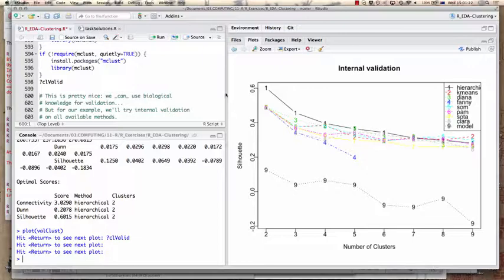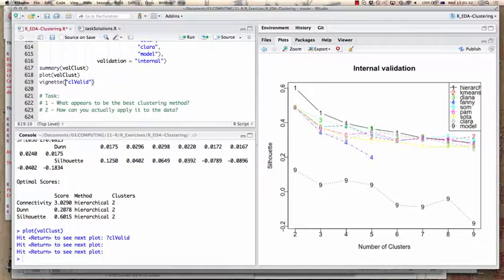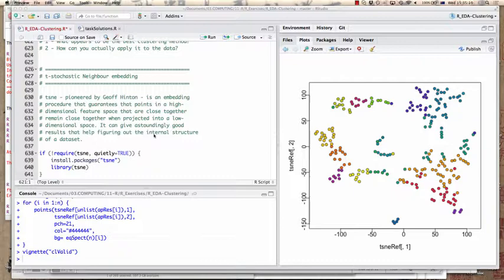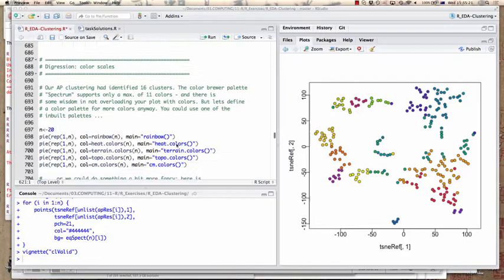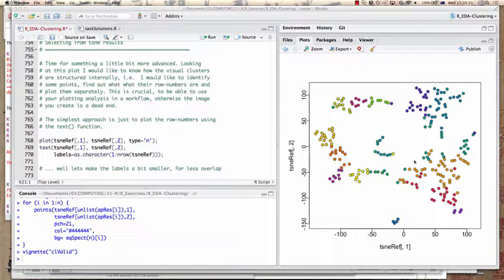I wasn't really happy with these clustering results — we had lots of clusters that all looked the same. So I've also taken this data through t-stochastic neighbor embedding. We've gone through how that works with the crabs and Cho cell cycle data. What I'd like to do now is talk more about how we can use such plots to actually identify elements, because in the end we don't just want to see that there are similar points — we want to know what these points are. I'd like to show you how to work with such plots interactively.